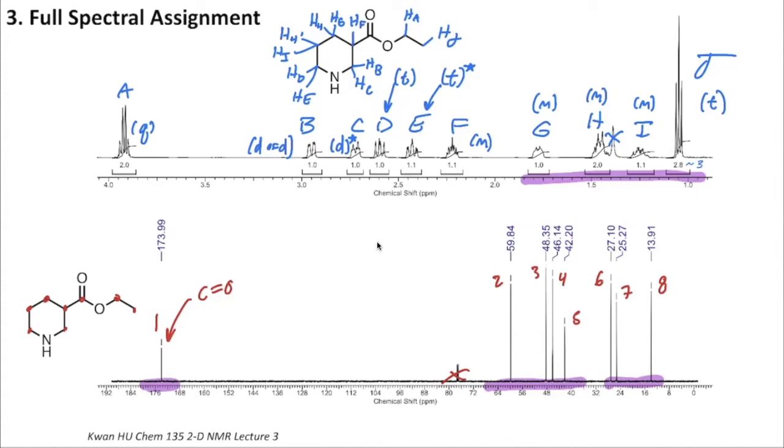Hey everyone, welcome to this extra video about the one-dimensional splitting for worked example number 4. I wanted to talk in more detail about the splitting that we see for this example, but I didn't think that it necessarily needed to be included with the whole worked example itself. So that said, there are a few spoilers in here. If you haven't watched the worked example video all the way through to the end, I recommend that you do that first so that you understand how I made the base level assignments.